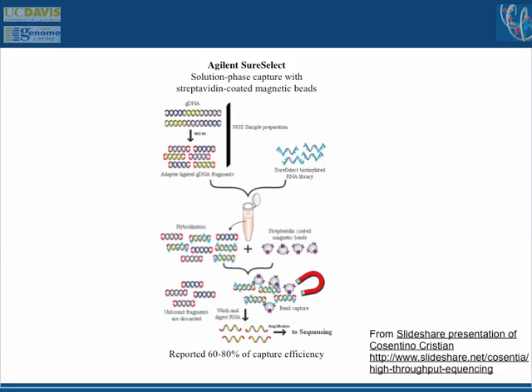PCR actually is a pretty good strategy if you can figure out how to feed these machines, because in some of them, you can add the barcoded adapters onto the PCR primers after you run the PCR. So you don't have to synthesize 1,000 different PCR primers. You can just have your set of tags, ligate them onto your PCR products, and then clone those, and you might be able to do this in a massively high throughput manner.